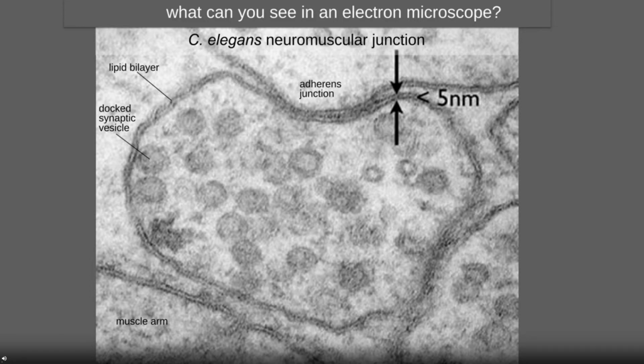And then this close association is quite important for its function. And there's actually a vesicle next to it, which has some distance to the plasma membrane. These are also important, but this 5 nanometer difference between these vesicles and the vesicle next to it, to the plasma membrane, is actually quite important for how synaptic transmission happens. And Grant is going to talk more about this topic.